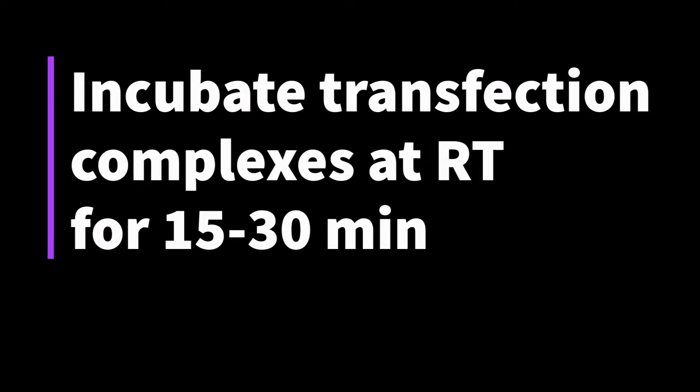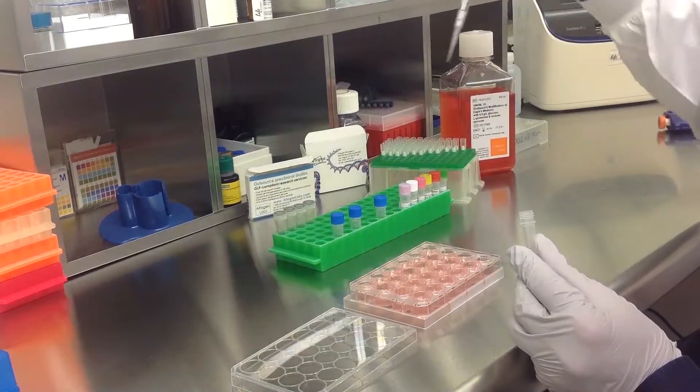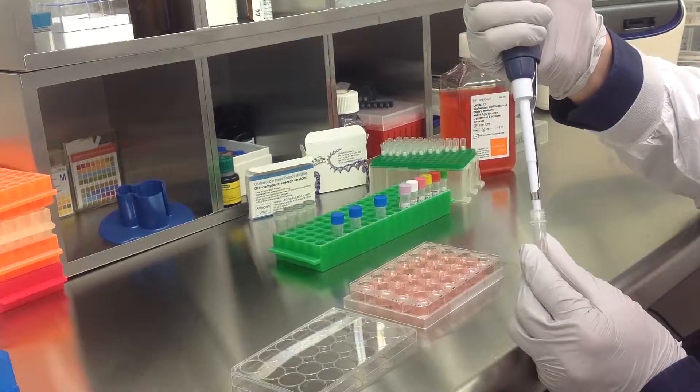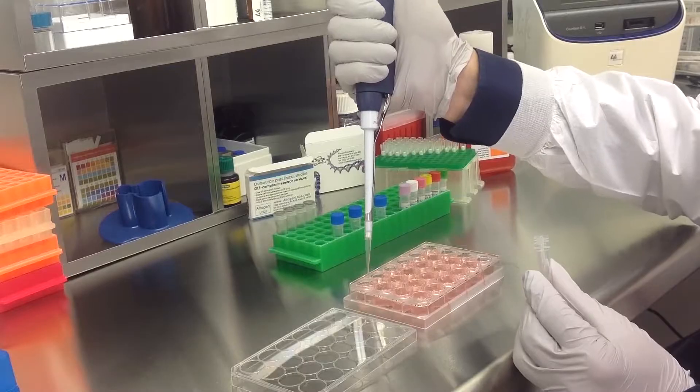Incubate the prepared transfection complexes at room temperature for 15 to 30 minutes. Then add the prepared transfection complexes to the 500 microliters of complete growth medium.